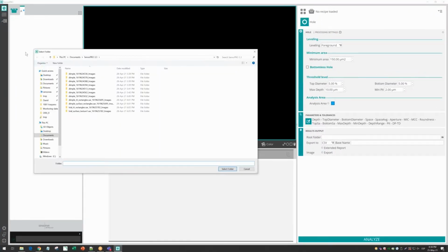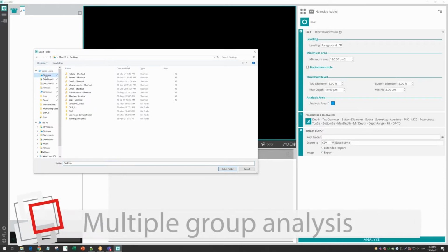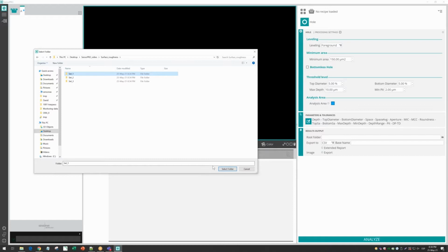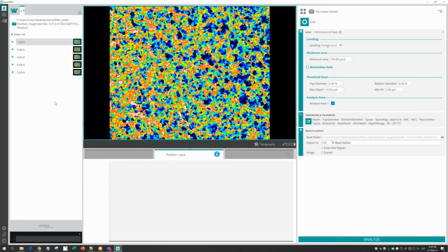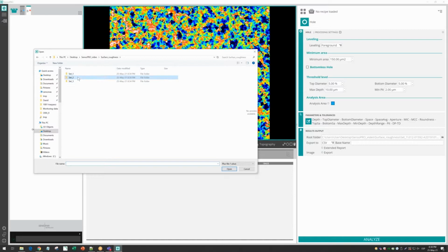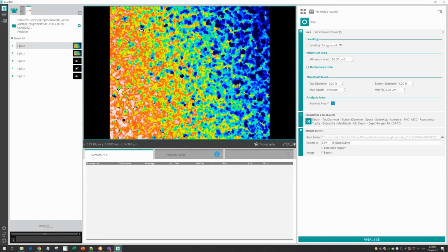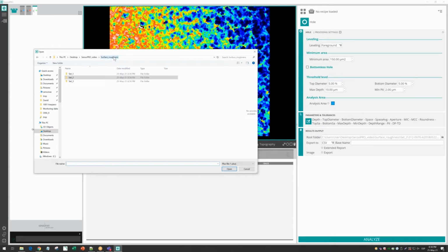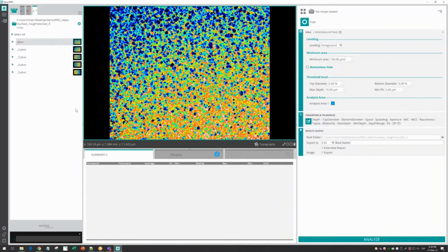First thing is that we are going to be able to compare different sets of samples. So let's go to set number 1. We will put this one. Then we can add another set of different samples, and we can add another. Actually, we can add up to 7 different sets of files. In this case, we are going to demonstrate how it would work for 3 measurements.